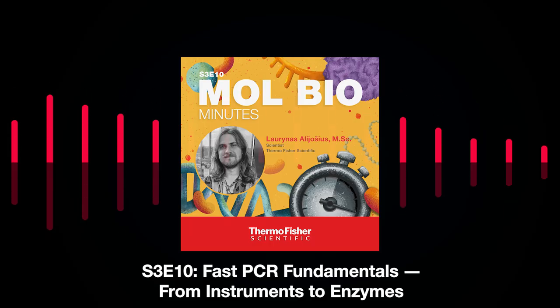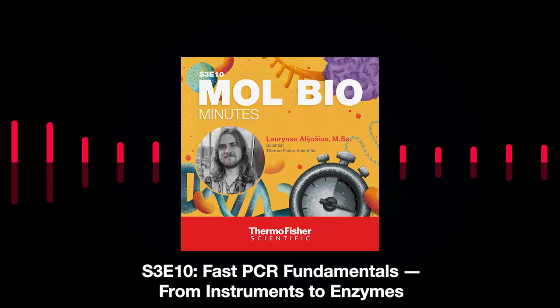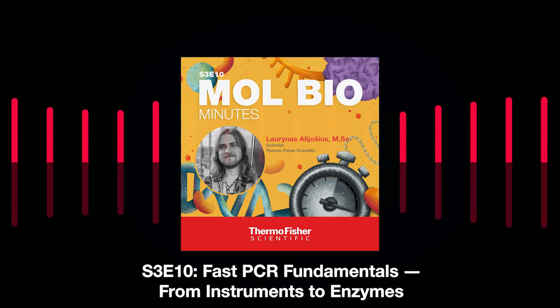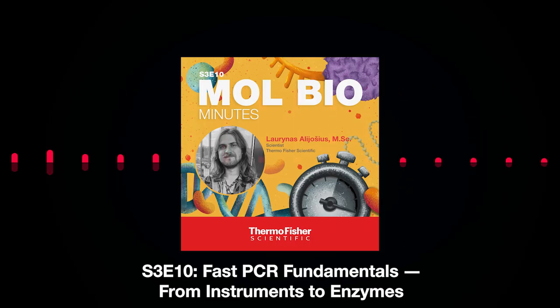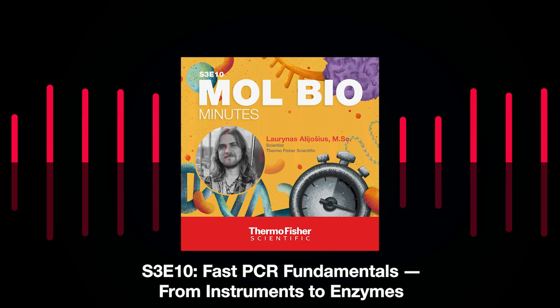So for example, it could be like using from half a unit to the whole unit of a fast DNA polymerase for a 25 microliter PCR reaction volume. But that amount of units can also be different. So it can vary depending on your DNA polymerase. And I think it's also good to take note of what it says in the manual of the DNA polymerase, because it can be different for each one of them.